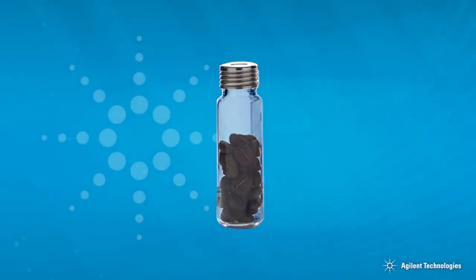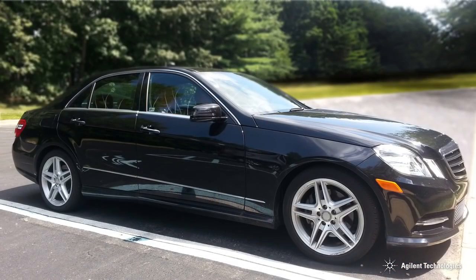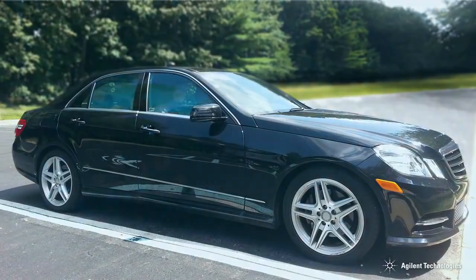As the sample is heated, volatile chemicals will be evaporated into the headspace of the sealed vial, which can then be injected as a gas into the GC. Think of how you smell chemicals in a new car that has the windows closed and is sitting in the sun. The car has become a huge headspace vial, and your nose is the detector.